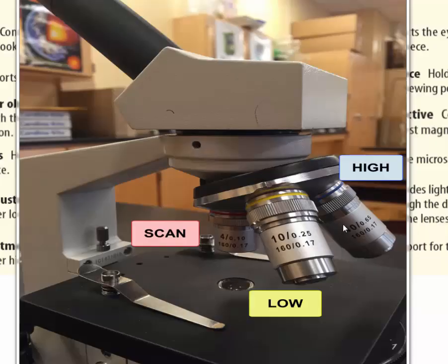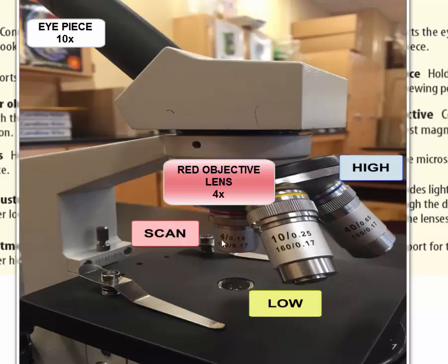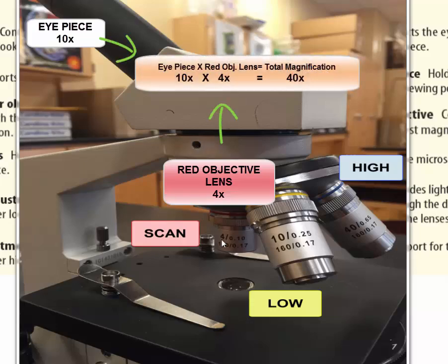Now earlier I mentioned that the eyepiece has a magnification of 10x or 10 power. This comes into play when we figure out total magnification of an object. The red lens here has the number 4, so when we take that 4 and multiply it by the 10 by the eyepiece that gives the red lens a total magnification of 40x. We just multiply the 4 by the 10 on the eyepiece.